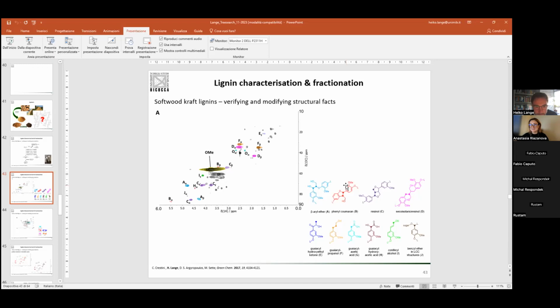Yes, thank you. Thank you, Heiko, for a great presentation. I really enjoyed it. I'm also in spectroscopy, although not in the lignin field, trying to get there. So the general question I have is, how do you obtain connectivity between your different units? Because within the unit, I could get it, you may employ HMBC or another type of experiment, but between the units it gets more complicated, because your HSQC only gives you different types of carbon-proton pairs, basically. So how do you get that connectivity and get that bigger picture of your lignin?